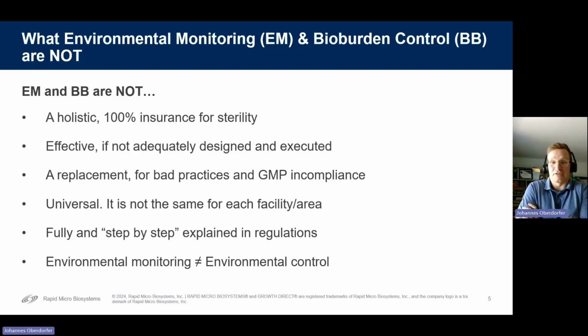They also definitely shouldn't be a replacement for bad practices and GMP incompliances. Just having them doesn't substitute for bad practices and incompliances. They are definitely not universal, so there is no one-fits-all solution.